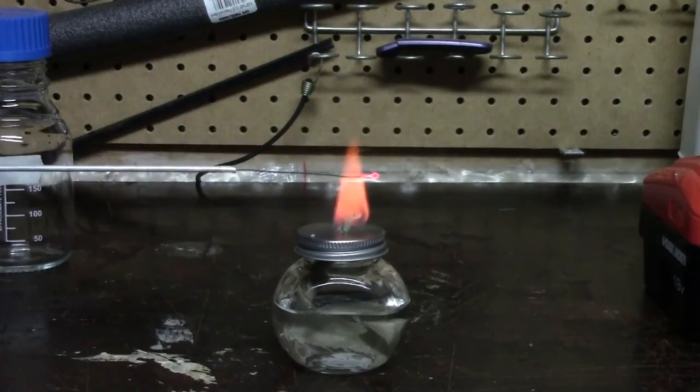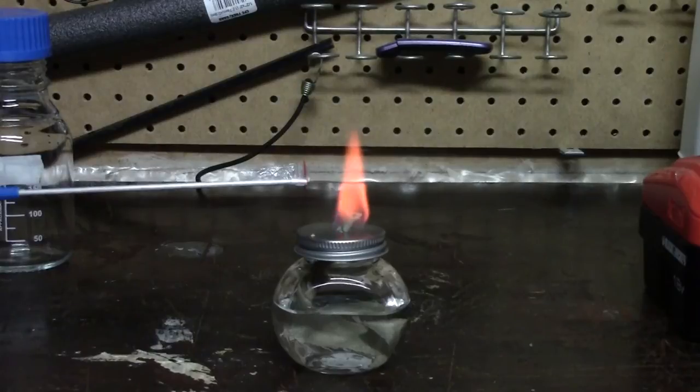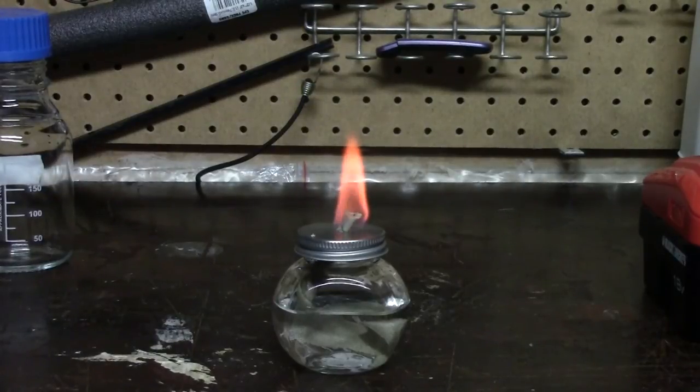And there you can see the loop's red hot. So that is obviously going to be completely sterile. And we can now use that to go into a plate or a source of cells to get some yeast without having to worry about contaminating the yeast.